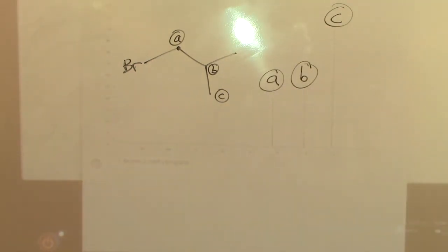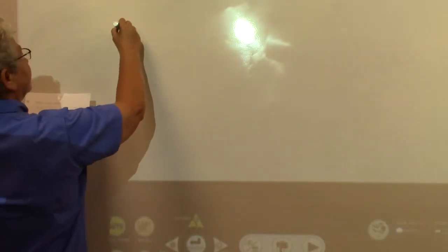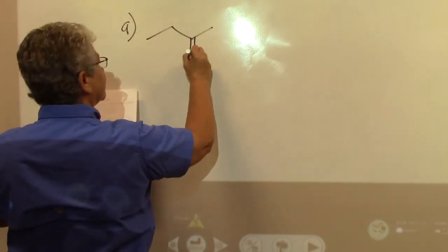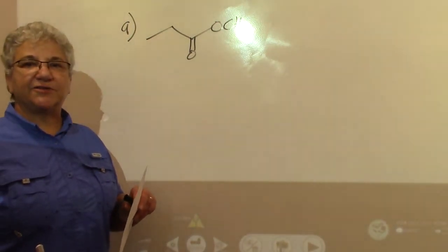All right. The next question, there's no spectrum for the next question, so you don't have a page in your notebook. The next question says, take these 3 molecules and simply tell me how many carbon resonances you would expect to see.